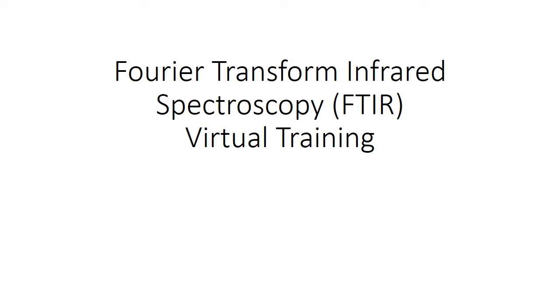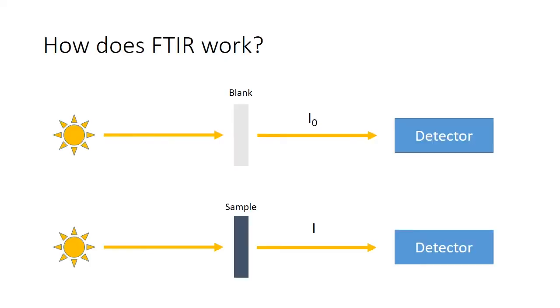This section will cover some of the basics of how FTIR works and also some of the different experimental geometries that we have on our system. So how does the basic FTIR experiment work?